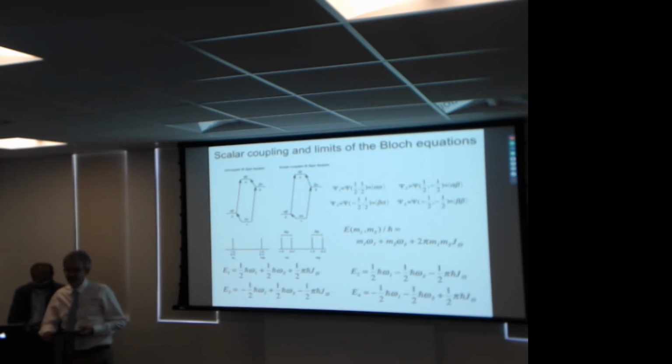One peculiar thing that's about to happen is that an NMR experiment is at some level classical. A solution sample typically has of order 10 to the 17th spins in it. That's a very large number. You don't expect quantum effects to be very large in a system with that many particles in it.